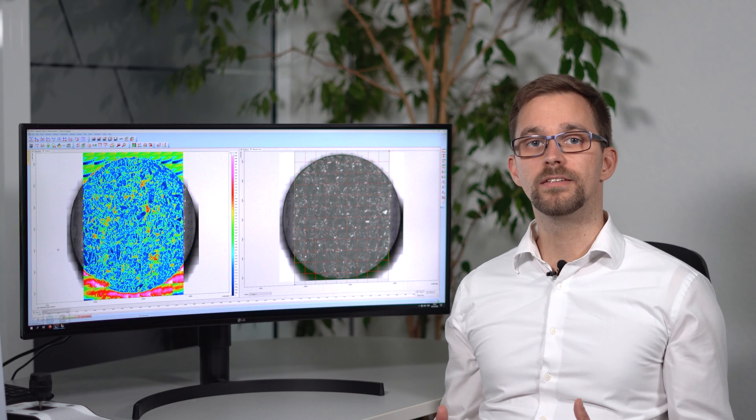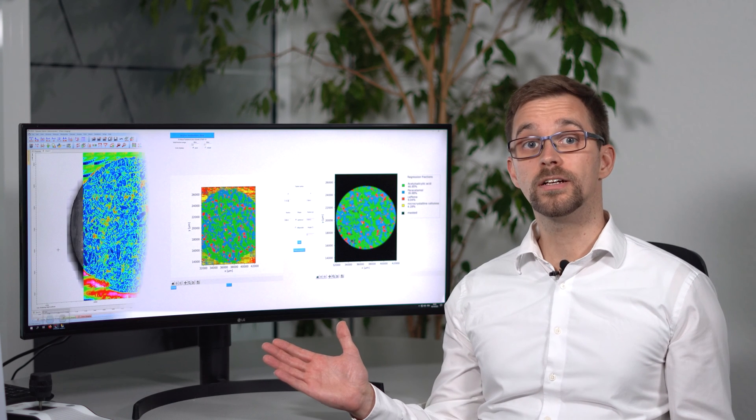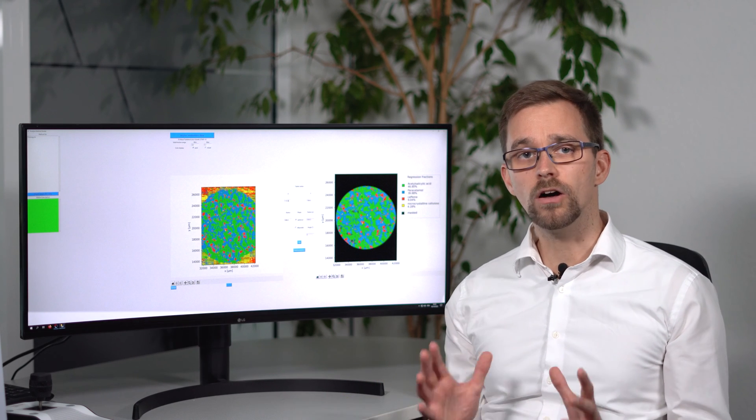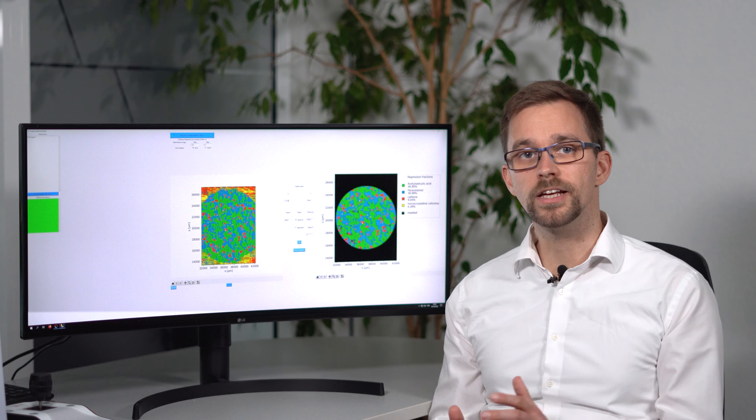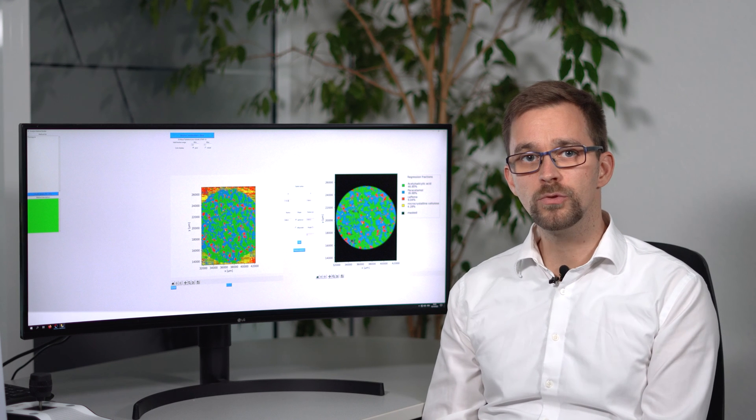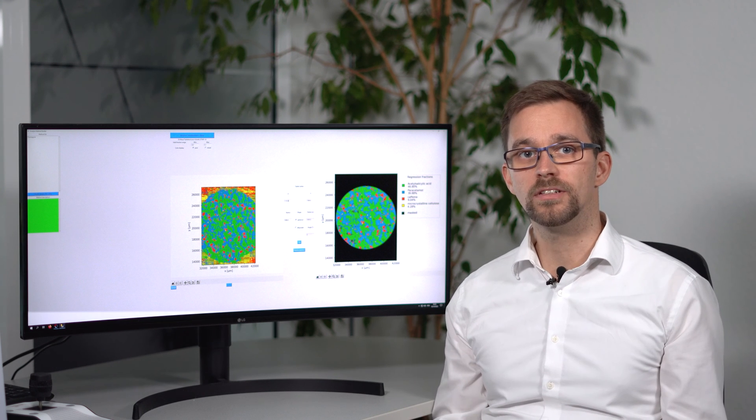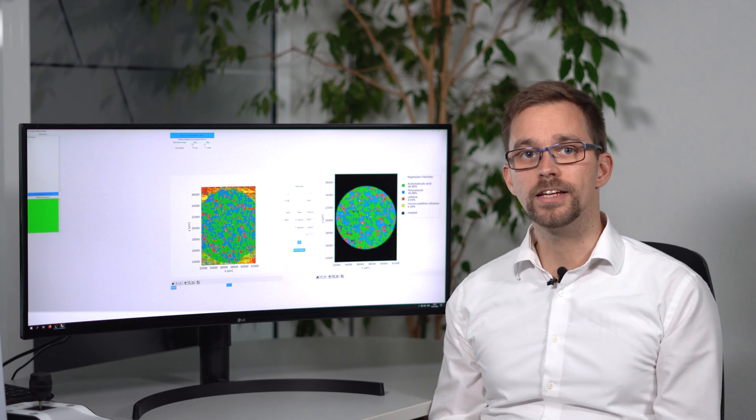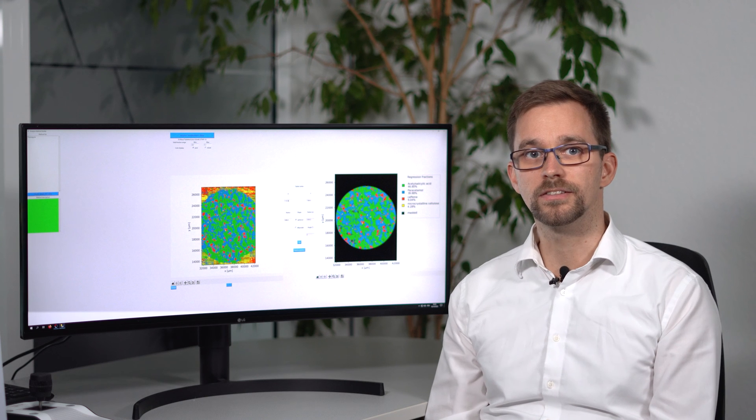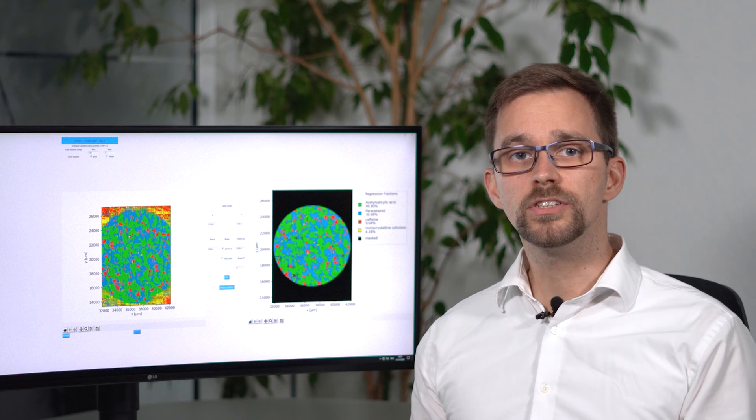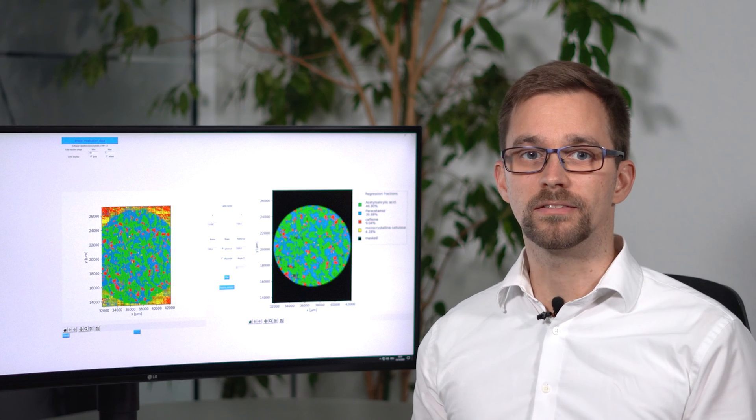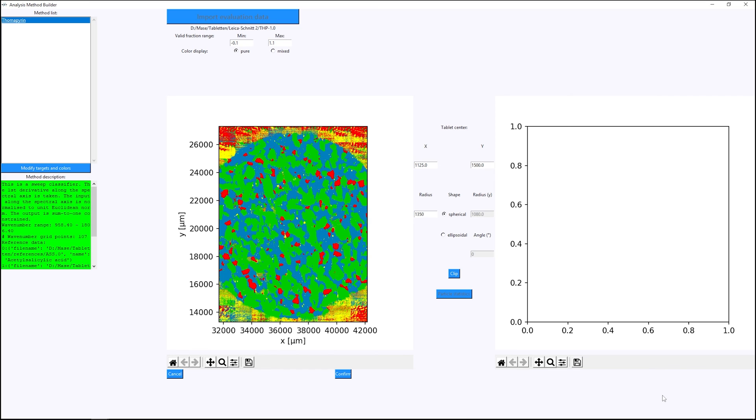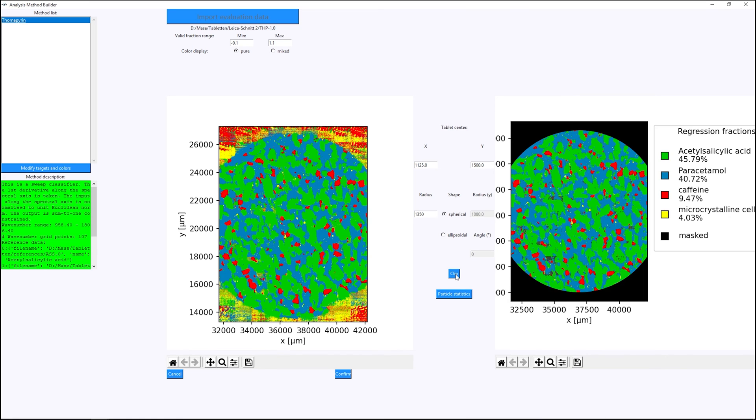Yet our innovation doesn't stop at the measurement. In fact, it reaches all the way into evaluation. I'm proud to present the BRUKER Tablet Analyzer. This tool visualizes the distribution of all components in the tablet and creates comprehensive particle statistics. At the push of a button in a matter of seconds, it analyzes the sample in its entirety and displays the results nice and clear.